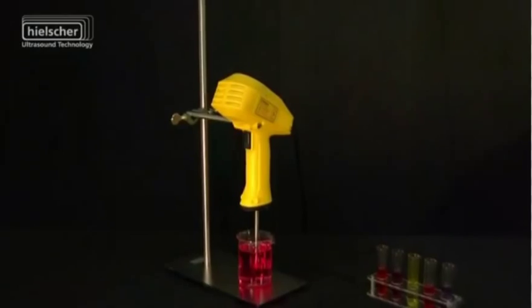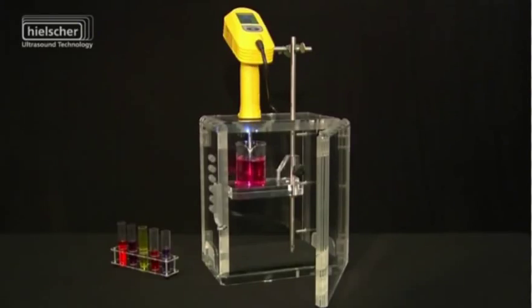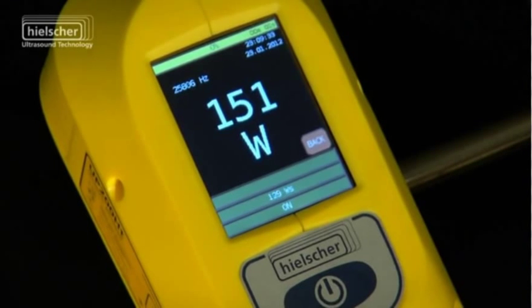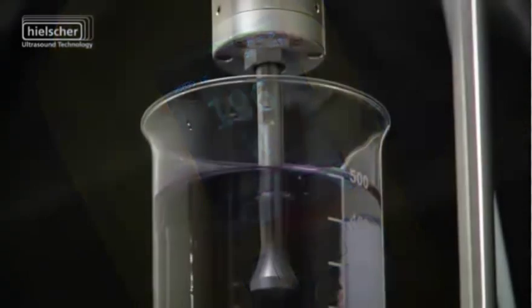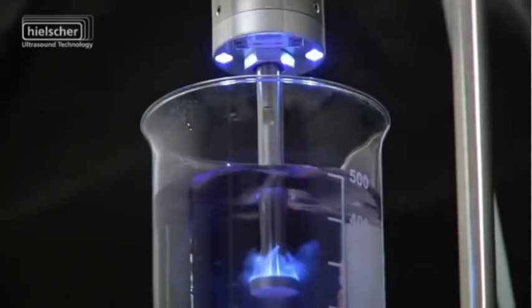Both models of the 200W ultrasonic devices can sonicate volumes from 0.1 milliliters to 2,000 milliliters reliably. The new ergonomic and lightweight design means it can be used as a convenient handheld device as well as classic laboratory support equipment.